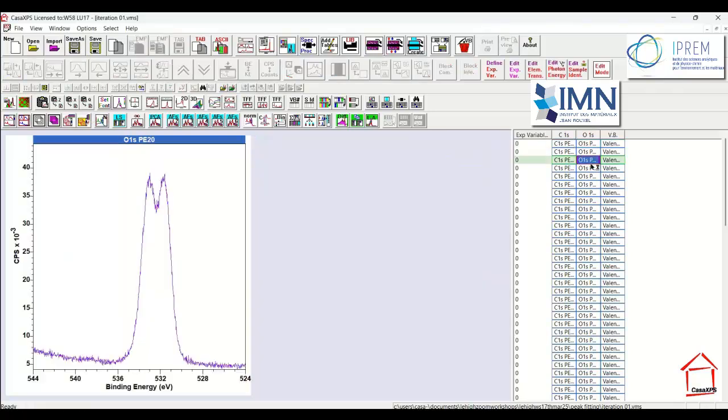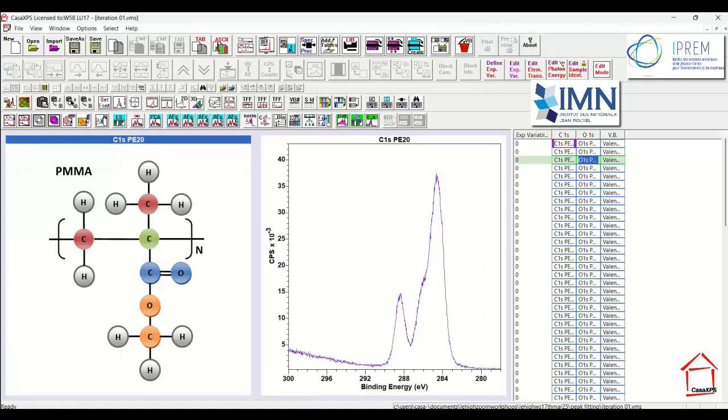So if I were to look at, for example, the Oxygen 1s and think, well, I'd like to go back to where I was, I could display using TFF, meaning the tile format file that is associated with this display state, or I could restore the format that I'd previously looked at. I'm going to press that button, and now I've got my Carbon 1s and my slideshow available to me again.